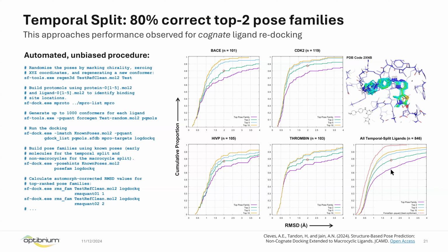Now, for those of you who know a lot about the docking validation studies, particularly in the early 2000s, you'll see that these levels of accuracy and success are pretty close to what people found with challenging cognate docking sets. So we're doing as well with docking very different structures, very new structures, in some cases very flexible molecules into naive structures that were bound to very different scaffolds, and we're getting roughly 80% correct across the board here with the top two solutions returned.